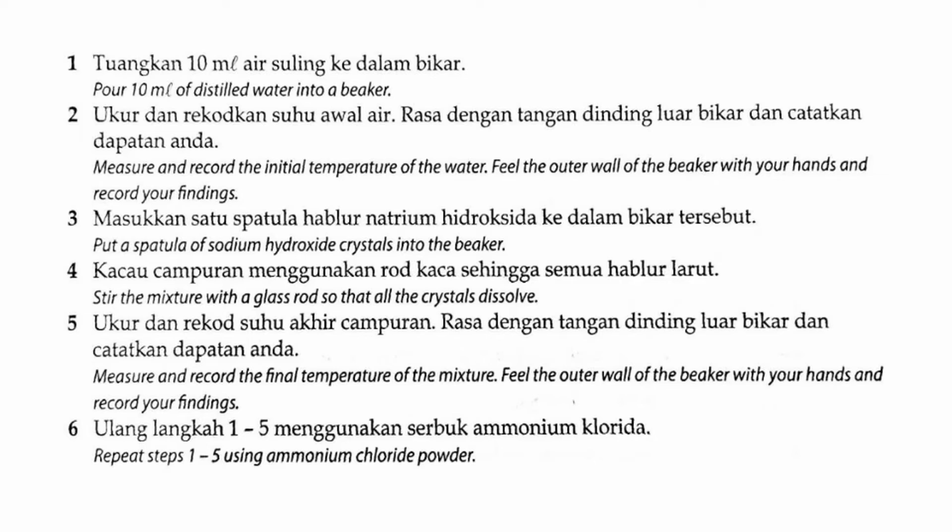Stir the mixture with a glass rod so that all the crystals dissolve. Measure and record the final temperature of the mixture. Feel the outer wall of the beaker with your hands and record your findings. Repeat steps 1 to 5 using ammonium chloride powder.